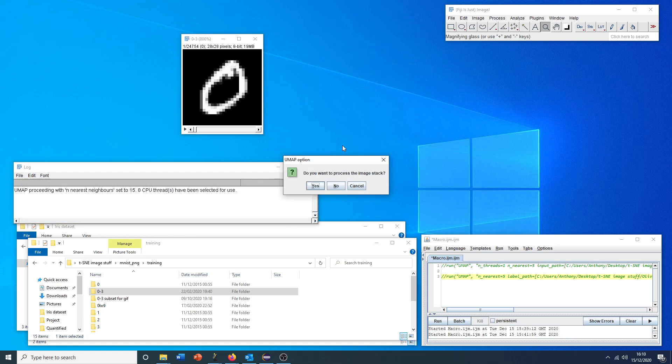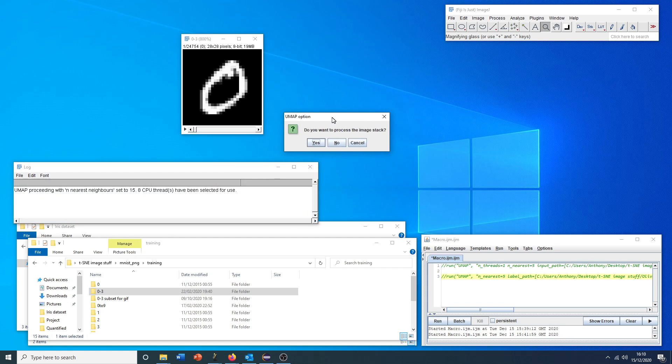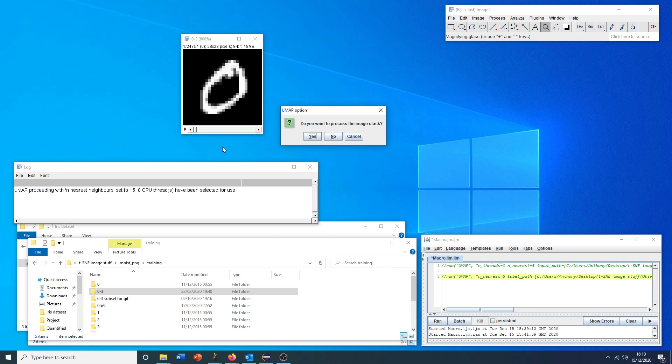This option to use a label file, I'll come to in a second, but this allows us to color the points according to some metric. If we click OK, we're now asked if we want to run this on the stack that's been identified by the plugin. We'll say yes.